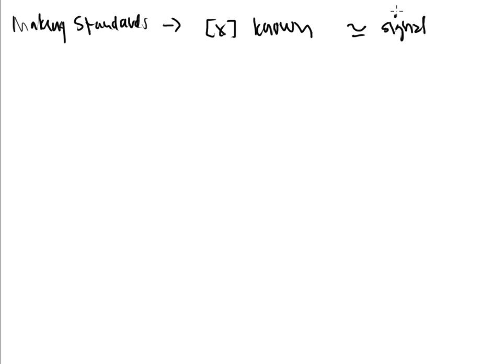Well, there's a proper way to make standards in a laboratory. And some people get confused with this because they're told different ways when they go into a laboratory. I'm going to tell you the preferred method of making standards. Don't use a cheater shortcut. We don't like shortcuts in a lab, and there's a reason that we don't like this shortcut, and I'm going to explain it to you.